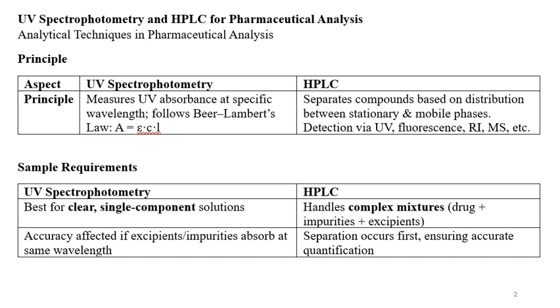Basically, we will understand the differences between these two techniques. These are the widely used techniques in pharmaceutical analysis. The principle of UV and HPLC.